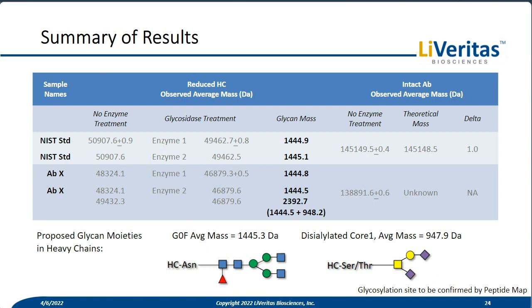Apparently, what we found out for our clients is that antibody X has a minor variant that has an O-link glycosylation site. And they were happy to figure out from these very quick experiments that all they have to do to save this particular drug candidate was to engineer out the O-link glycosylation sites that remained on the heavy chain. The light chain remained unmodified in their production process.